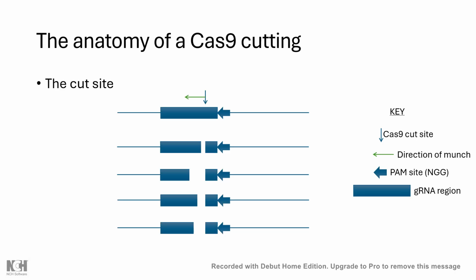Now with this detail in mind, because this is super important, as covered in one of my other videos, you introduce wobbles to guarantee that the guide RNA site is lost in your repair template. But also, when comparing your wobbled template to the wild type, you notice a difference in restriction sites, either intentionally or accidentally, that have been changed. And the position relative to this diagram does change how your knockout or knock-in is going to go. I've given them different names based on their traits.